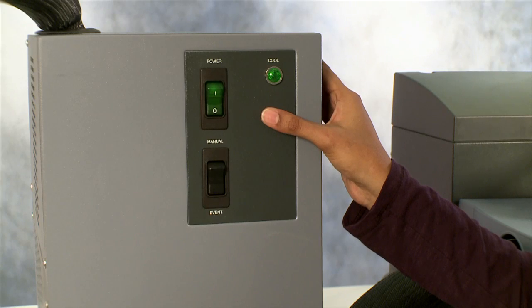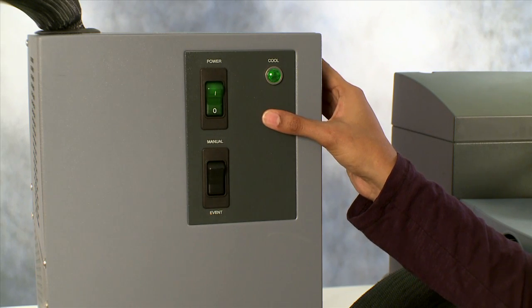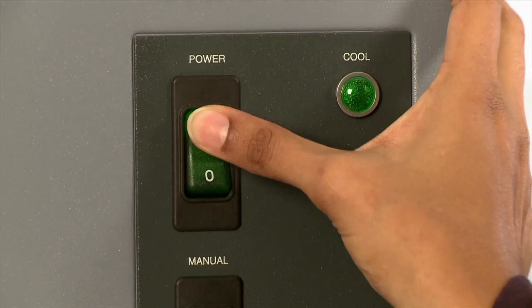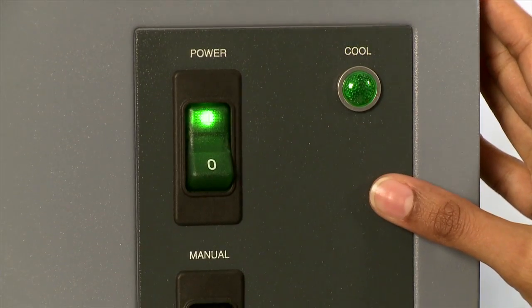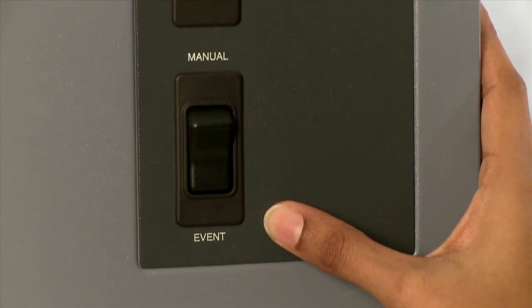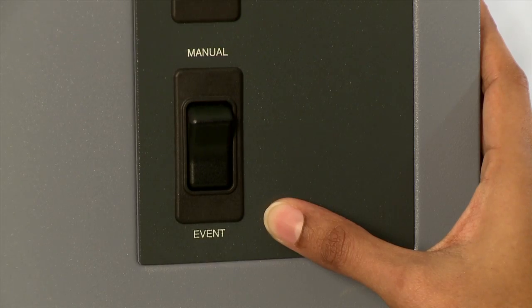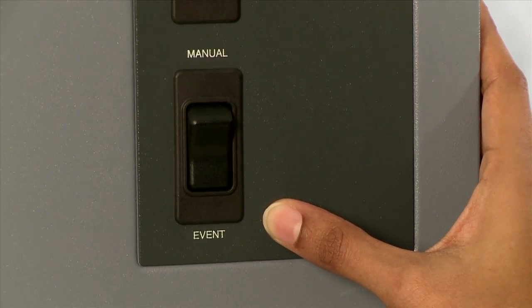As you can see, the RCS is off. Prior to turning on the RCS, turn on your gas supply. Then power the RCS on and ensure that the second switch is set to event mode. The event mode allows you to control the RCS from the instrument control software.